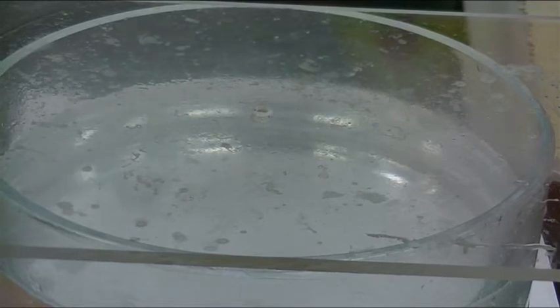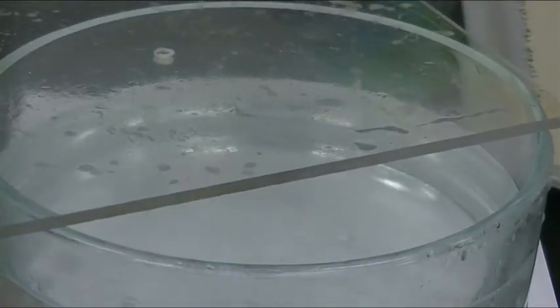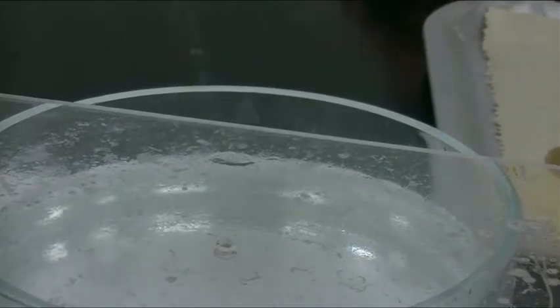So it turned into a little ball, though, a little sphere. Lots of gas again. It's fogging up in there. You can see it's reacting more than the lithium, going much faster. The gases are gassing off a little bit more vigorously. Oh, yeah, that's sizzling. I probably should have done it that way. See those fumes coming off there.